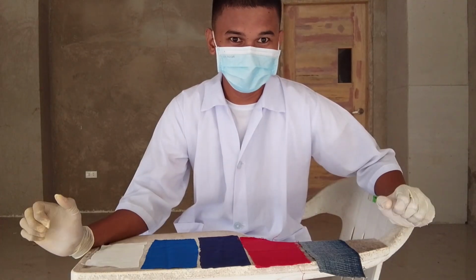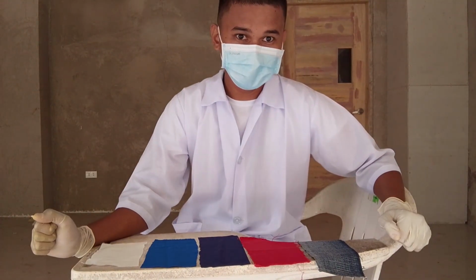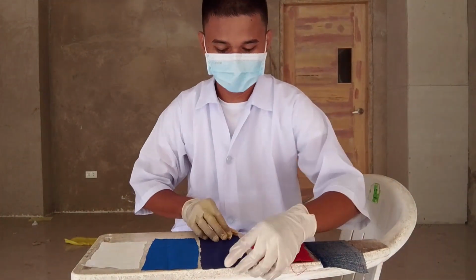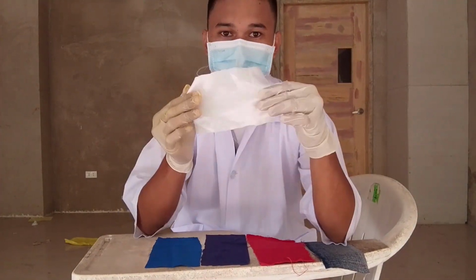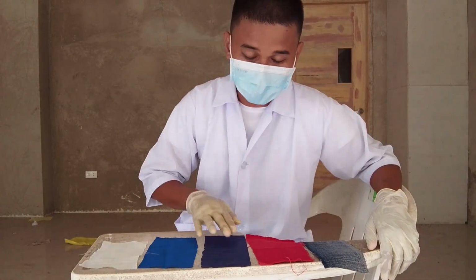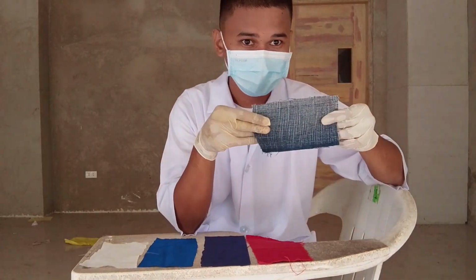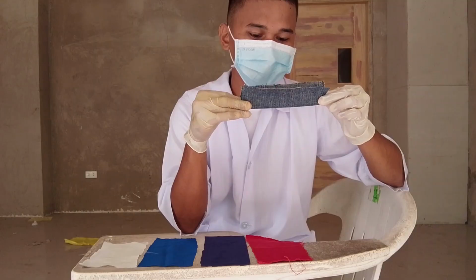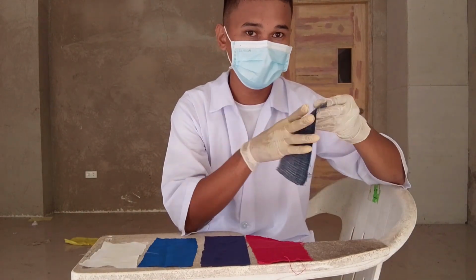I will now proceed to five different types of fibers. The fibers I use are old denim, cotton, jersey, satin, and lastly silk. I will now differentiate these five types of fiber samples. I will first differentiate the old denim fiber. To differentiate this, we need to identify the color, texture, shape, and size.